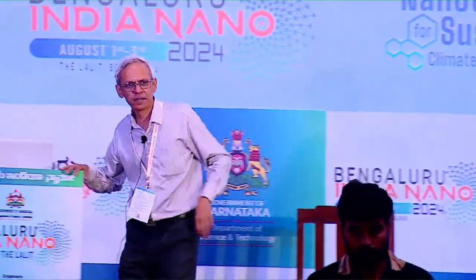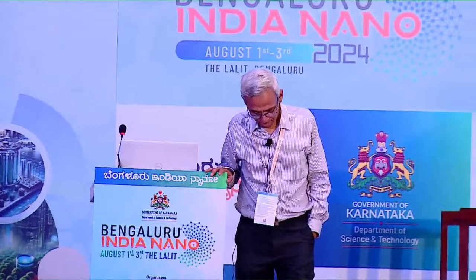You have mentioned that multi-layer analysis can be done. Yes, like heterostructures or whatever. My question is how many layers is it possible to analyze, maximum, using HRTEM, and how accurate is it going to be?